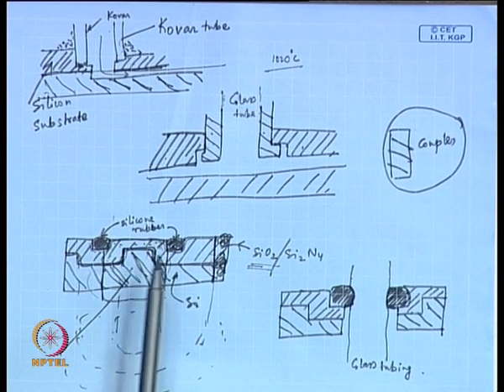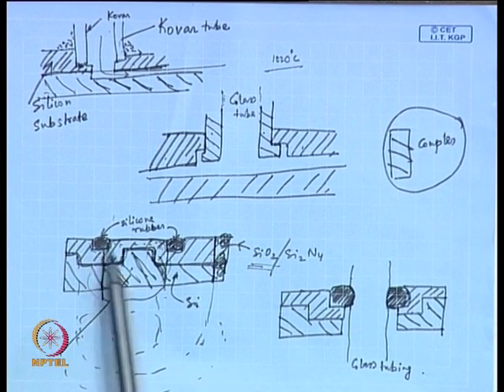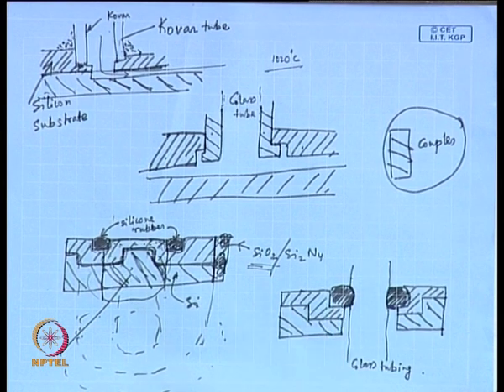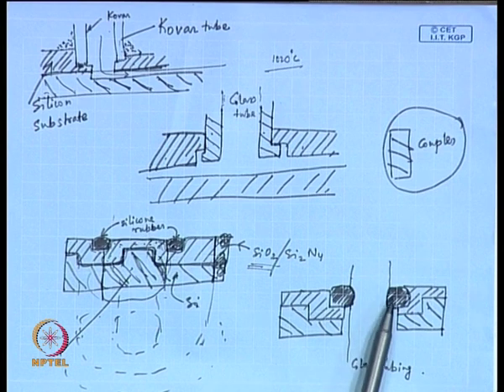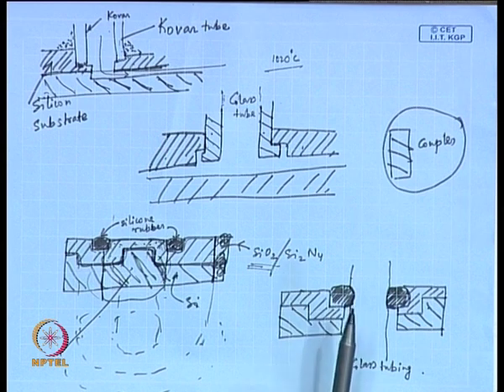this fluidic access made, and this silicone rubber is acting as an O-ring. You know what an O-ring is, okay? You need an O-ring which practically acts as a gasket. So, this would be acting as an O-ring. So, what you have is this structure with an integrated O-ring. That means, you are not having a separate O-ring which you put and then you put the tube, it is not that way. Instead, you have the O-ring already inbuilt inside the structure, that is what we are referring to as integrated O-ring.